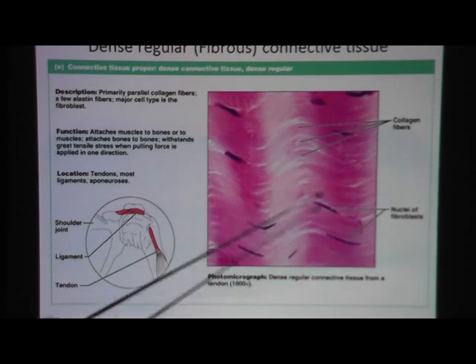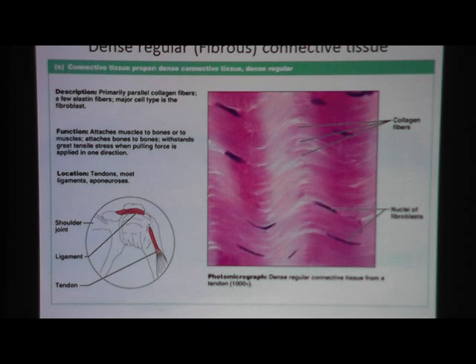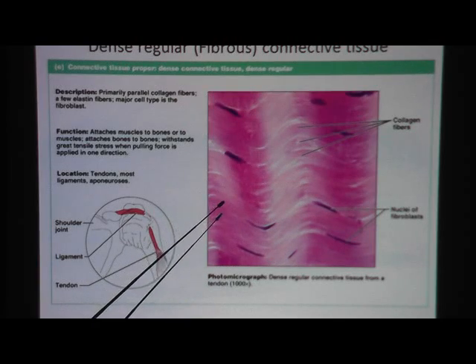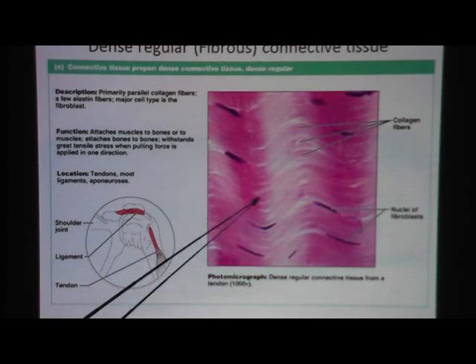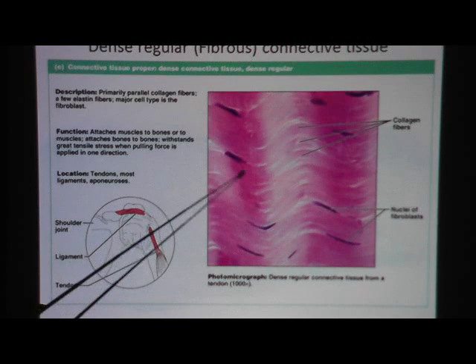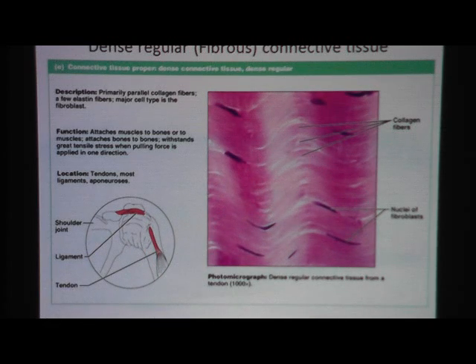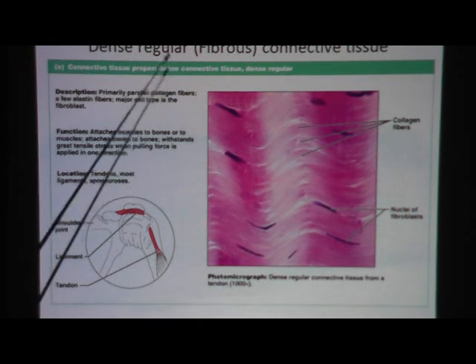Collagen fiber, remember, we saw in areolar connective tissue. Back then, it was that thicker lines running through the slides, pink most of the time. Here, you see it wavy. These wavy pinkish lines are collagen fibers, all stacked nicely on top of each other. And because they are stacked nicely, it's in a very organized manner. That's why it's regular.